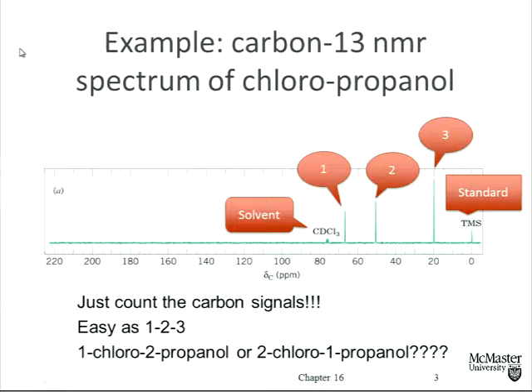What can we do with that information? Well, we've got the mass spec of the compound. We know the molecular weight, right? We might also know, for example, that there's an oxygen in there because we've got the infrared spectrum and we see a C=O double bond stretch. So what we're trying to do in solving the structure, to get ultimately to an unambiguous structure, is to take little steps. First of all, we got the molecular weight. Now what we would like to do is work towards a molecular formula next, right? A molecular formula just tells us how many carbons and hydrogens and oxygens we've got. It doesn't tell us what functional groups are there or anything.